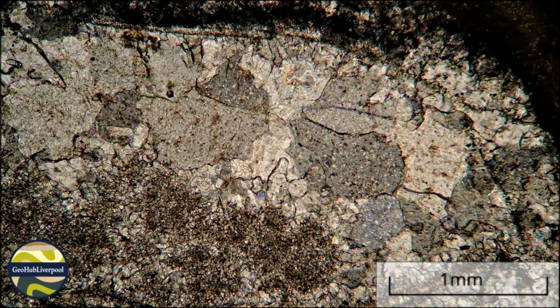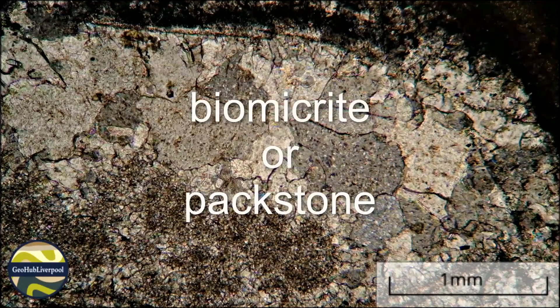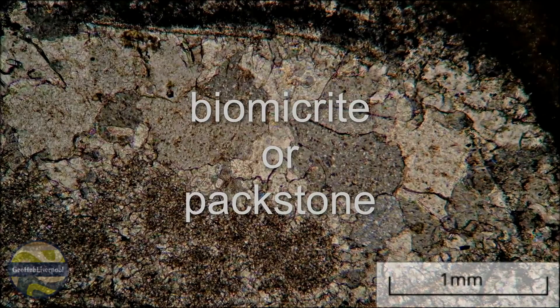It is a bioclastic limestone. This rock would be called biomicrite under Folk's classification system, because it is composed of bioclasts in a micrite matrix. Under the Dunham classification of limestones it would be named a packstone, because it contains mud but it is grain supported — that means the bioclasts touch each other.